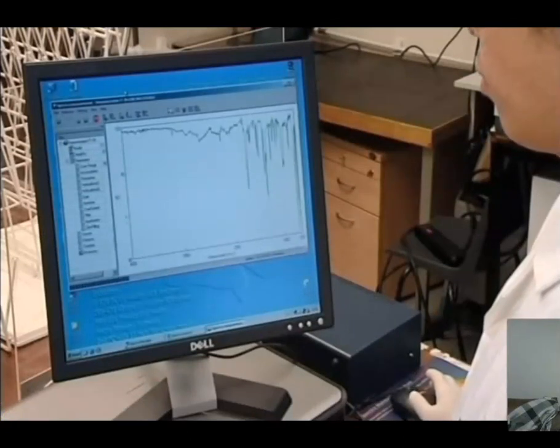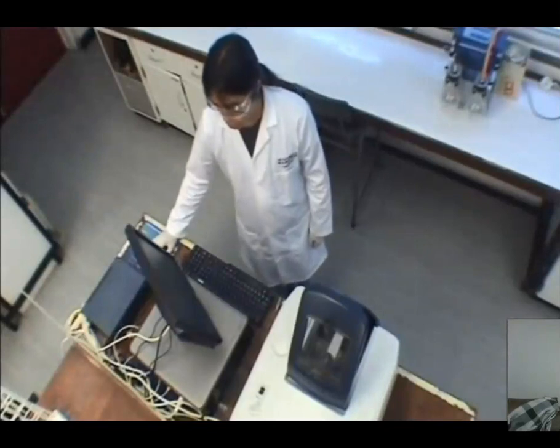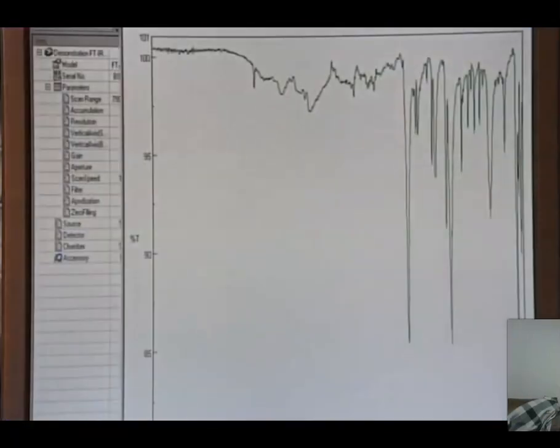This gives the intensity of the infrared radiation at each frequency separately. The transformation is handled by the computer and produces a graph of percentage transmission against wave number. This is what the chemist interprets. The essential point is that pulses of infrared radiation consisting of a range of frequencies simultaneously are passed through the sample and arrive at the detector. Some frequencies are absorbed more than others, depending on what bonds are present in the sample.